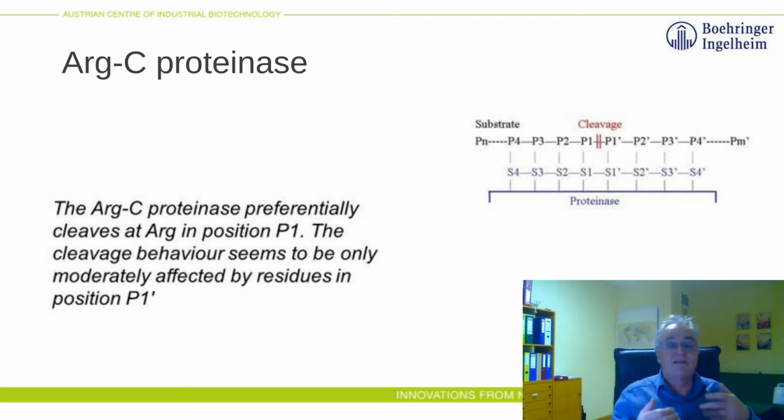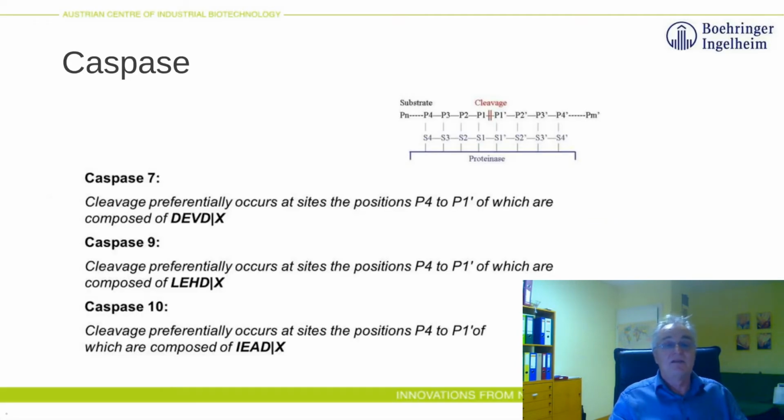If there is another amino acid, it is not useful, and also the P1 prime will interact and will moderate this cleavage.